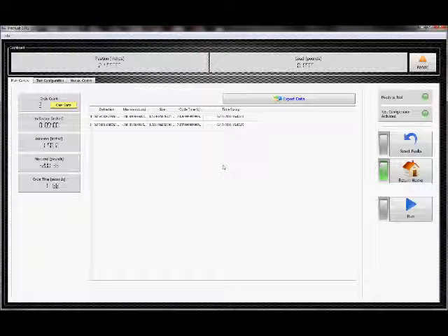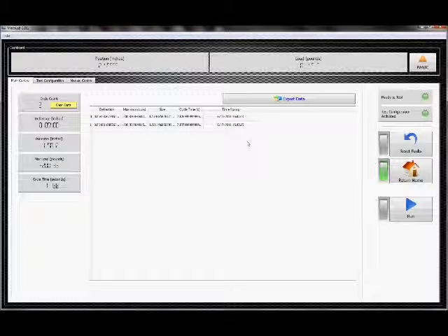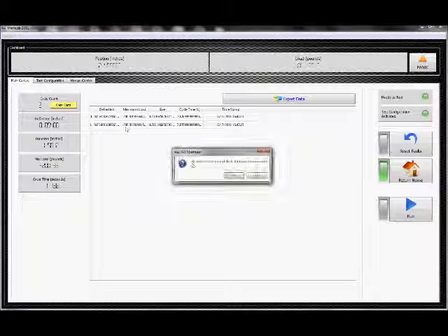When we're done with the software, we can simply close the program by File Exit, or just by closing the window. The system will be completely shut down. Are you sure? If you say no, nothing happens. If you say exit, the system will shut down.